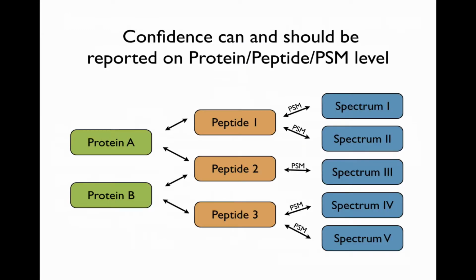I forgot to mention as well, we'll have to look at the null model a little bit differently for those different experiments. Whether it's the PSM being incorrect as the null model on PSM level, the peptide not being present could be another null model on peptide level, and on protein level we have to adapt the null model quite a lot to the different protein inference procedures we're using. But given a correctly used inference procedure, we could still say that one could use methods similar to target decoy competition to deduce protein level false discovery rates.